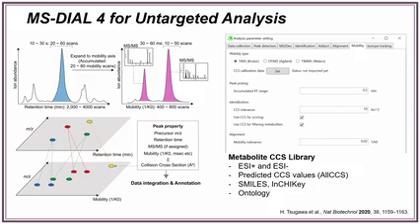The interface for working with MS-Dial is really nice, so you can set it up to do CCS calibration if you are working with a platform that requires that. There are lots of different tolerances that you can try out for how strict you want to be in the matching process for CCS values, or how strict you want to be in aligning different drift times.